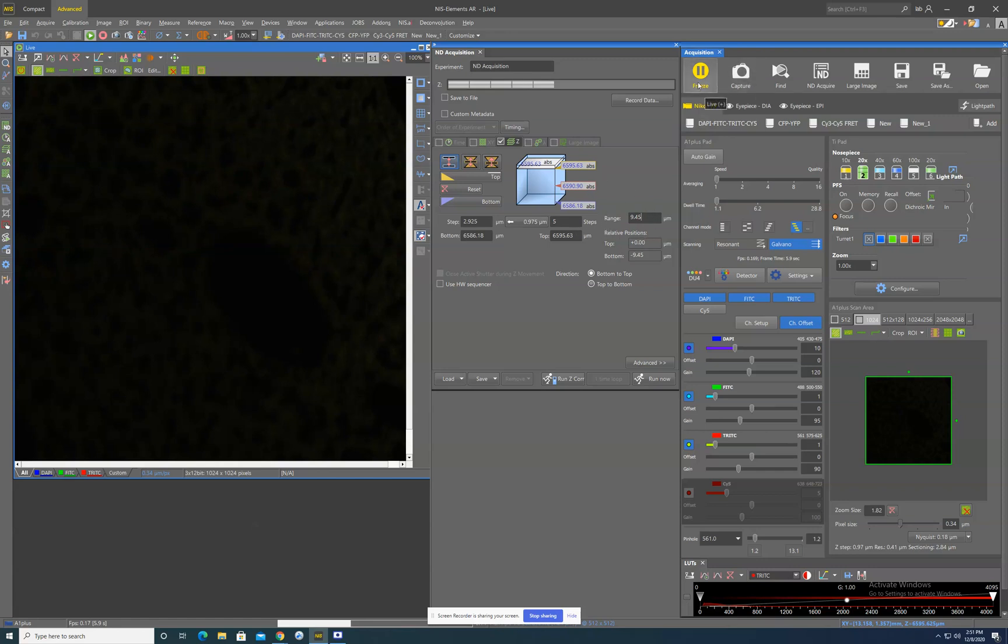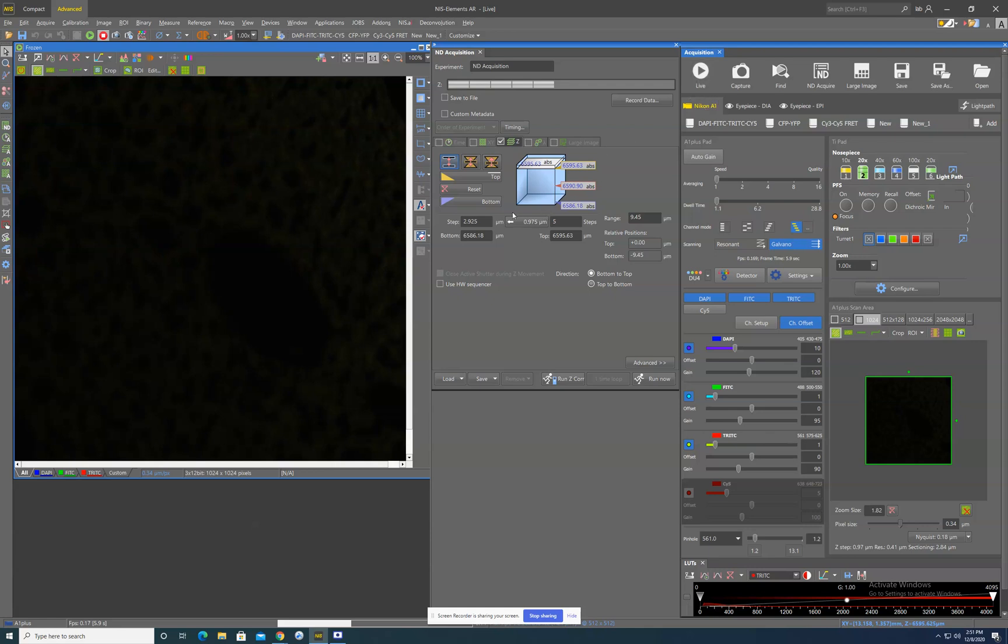So now that we have this range defined, we now have to tell the software how many pictures we would like to take within this range. So as a general rule, no average user is going to know what that number of images should be. So right here in the center, you have this button here. It says in this particular case, 0.975 microns. This is a calculation that is generated by the system based on your live working settings.